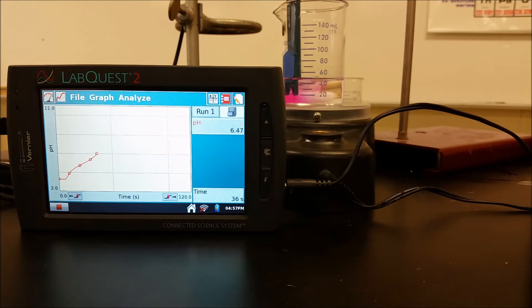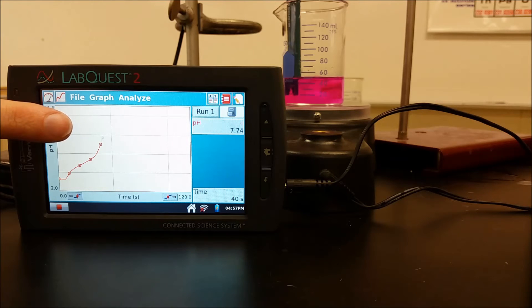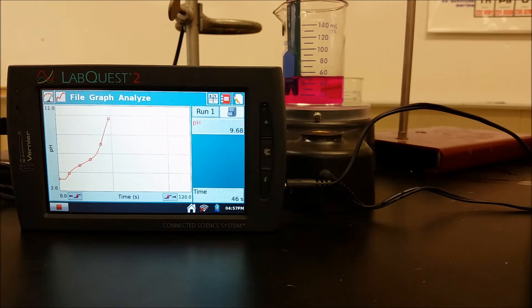So we're now starting to see some flashes of pink, but it's not gone completely pink until right now. And now if you look over to the pH curve, we're right where the equivalence point is, and so therefore our equivalence point and our endpoint are nearly identical, and that's optimal to getting a good result.